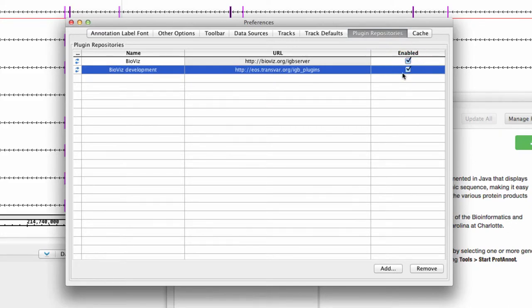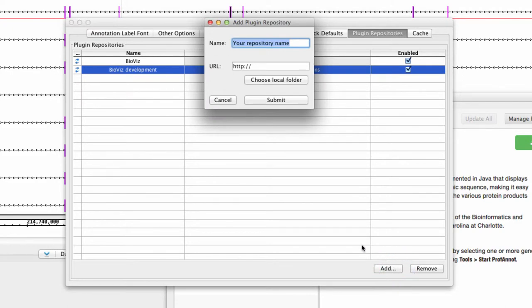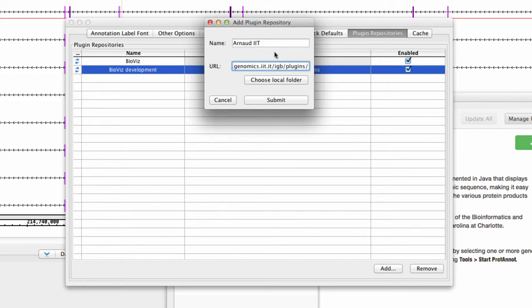To add additional app repositories, click Add. Enter a name for the repository, followed by the URL for the repository, or choose a local folder if stored locally.